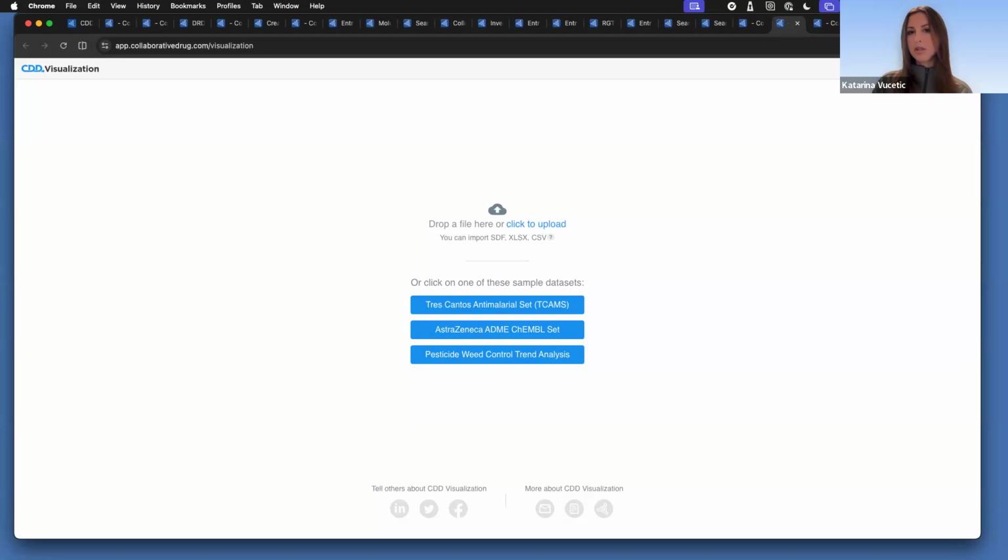Like I mentioned at the beginning of the session, it's used by more than 700 organizations worldwide. It's something that has existed for 20 years now, or a little bit longer. So it's not something new, but it's evolving with time as well. We're keeping pace with it and keeping it modern, flexible, and easy to use.